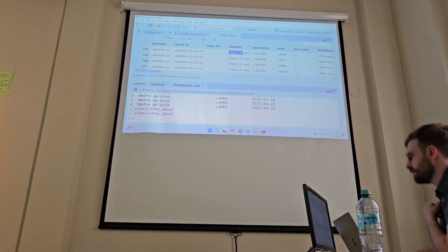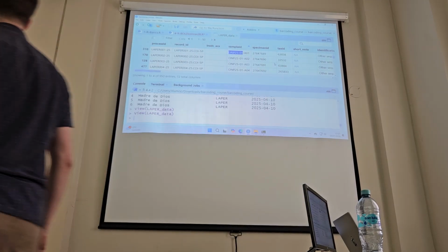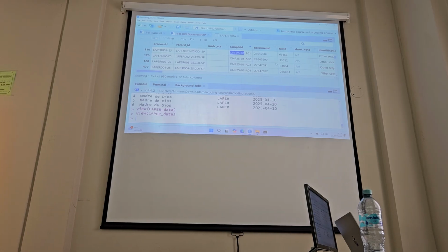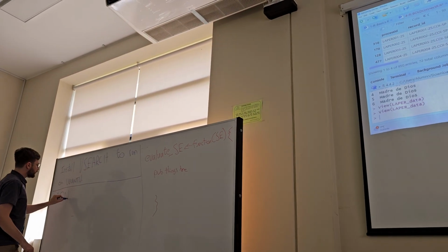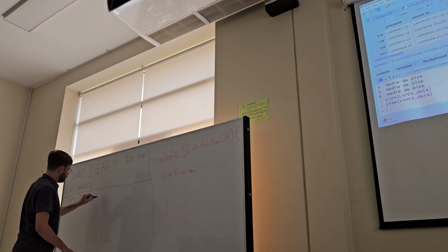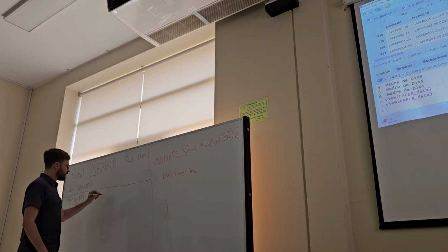The sample ID starts with ONP2501. Okay, so what I want you to do is make a new data set.